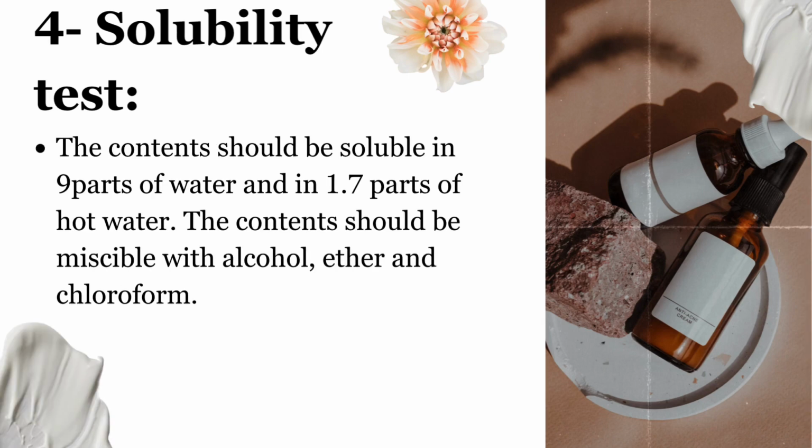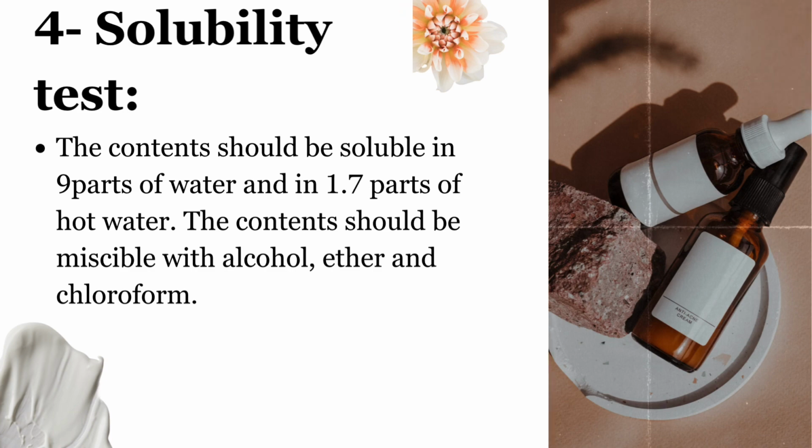4. Solubility test. The contents should be soluble in 9 parts of water and in 1.7 parts of hot water. The content should be miscible with alcohol, ether, and chloroform.